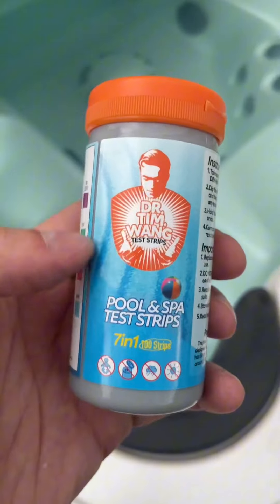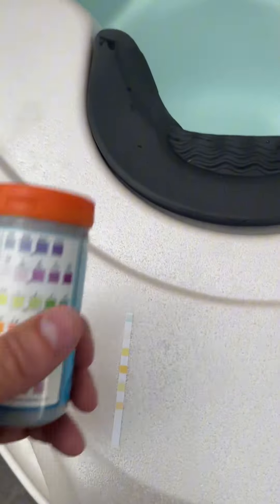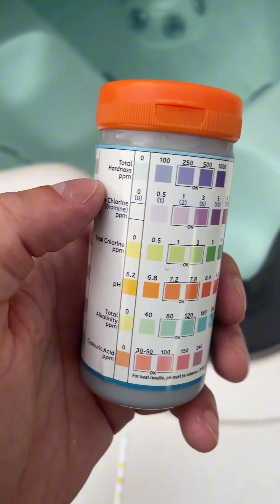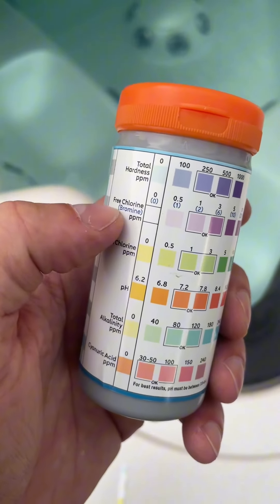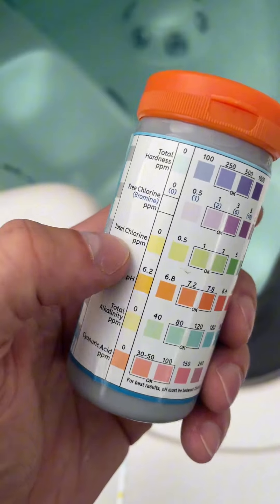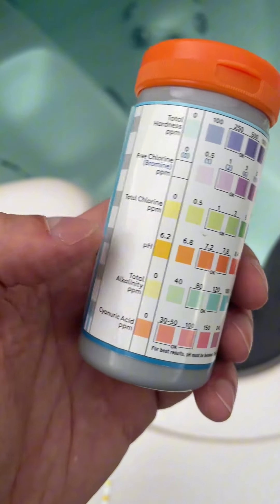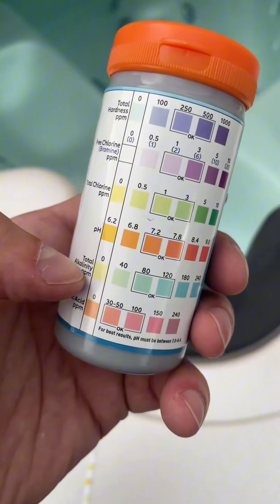This one has seven-in-one, meaning you get seven different readings from one strip. It covers your total hardness of the water, your bromine, your free chlorine, and your total chlorine if you're doing a chlorine hot tub or pool, then your pH which is very important, your alkalinity, and also your cyanuric acid. You don't have to know the science behind it — it's really just color coding, which is super nice.